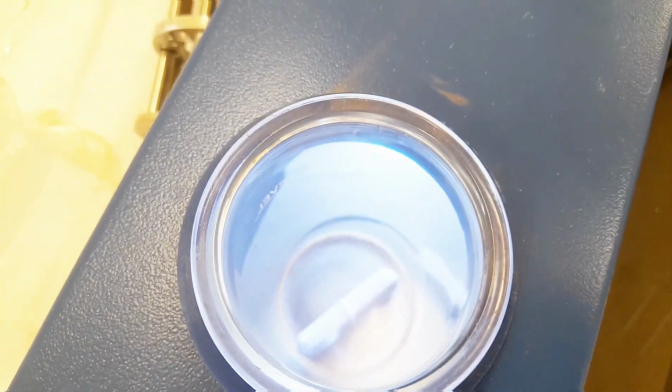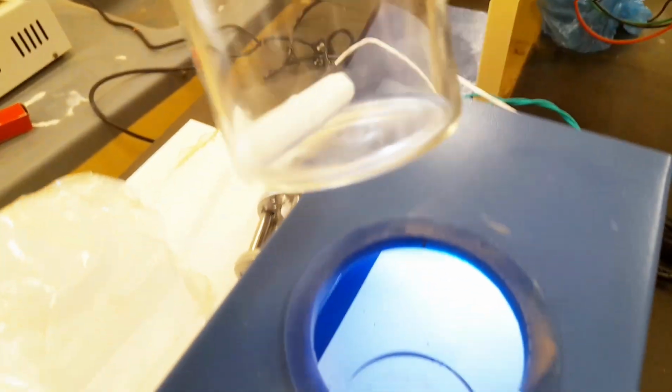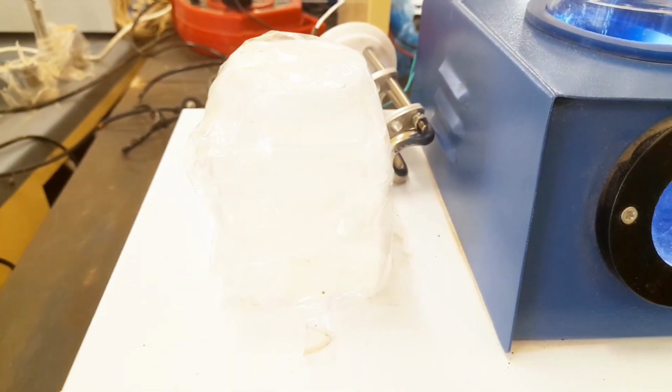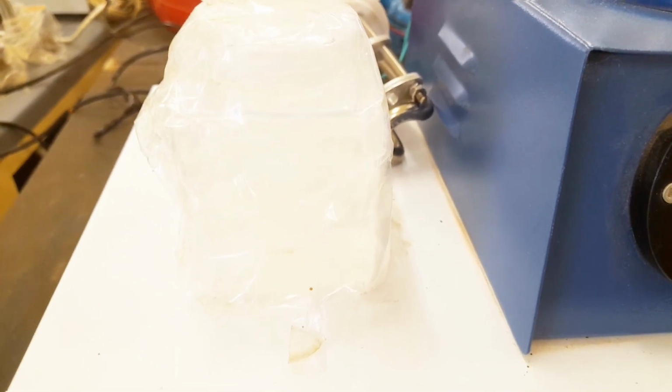This is the main part. You can see the stirrer is available here, inside the glass beaker, which has an indication of the oil level. You can put the oil up to this level. The beaker contains a magnetic stirrer. The oil we use is silicone oil, specified for this purpose, which can sustain high temperatures. This is the packed one. We have to fill this oil into the beaker, and I have arranged the stirrer inside the glass beaker.